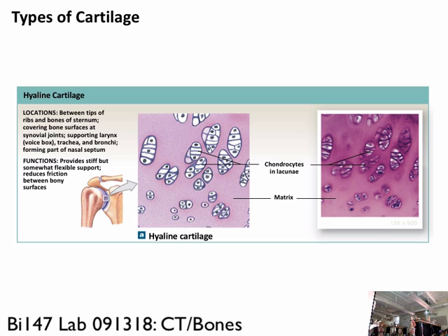It's important to understand here, the thing that I want you to get from this is really notice the structure of the cartilage. What does it remind you of? Can anybody physically describe, if you were to think of some other material, what does it sort of look like? So knowing what it is, it's got this solid stuff with all these little holes, these bubbles in it, these void spaces. It looks to me a little bit like a sponge. And so there's the solid stuff and there's holes in it.